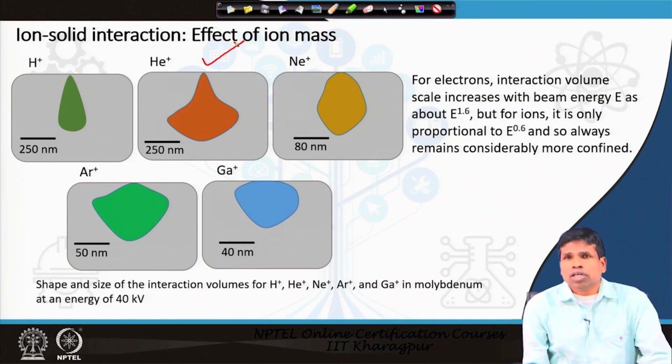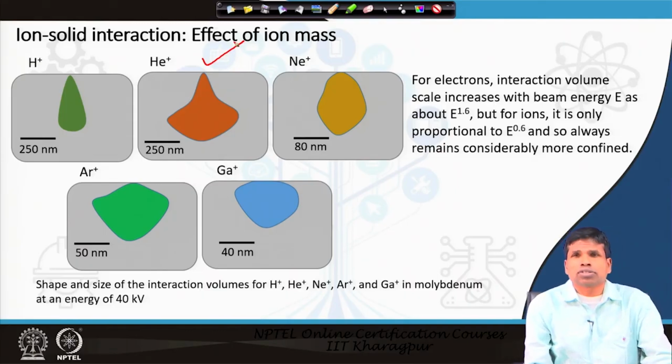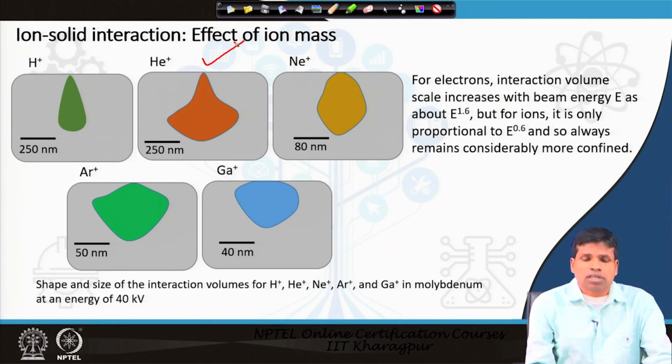Certainly it has to be inert. Hydrogen has also been used for microscopy purposes, but it is not suitable for all kinds of samples, because hydrogen produces a reducing atmosphere and it can react with the specimen. Therefore, helium being inert is preferred for microscopy purposes.